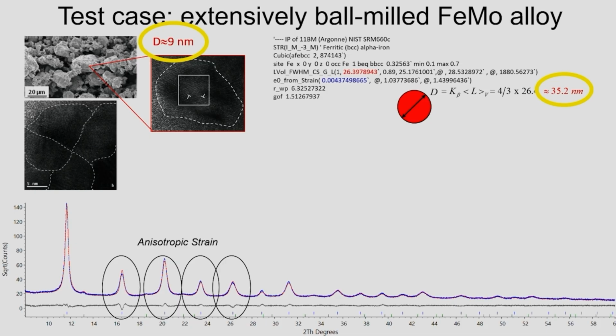So let's talk about strain anisotropy now, which is something I think is of interest. It's also in the title of my talk, if I'm not wrong. So how do you deal with strain anisotropy? This is something you can do with TOPAS and many other software. First of all, I will show you how you do that with TOPAS and other software, which sort of works, okay, but with little troubles.